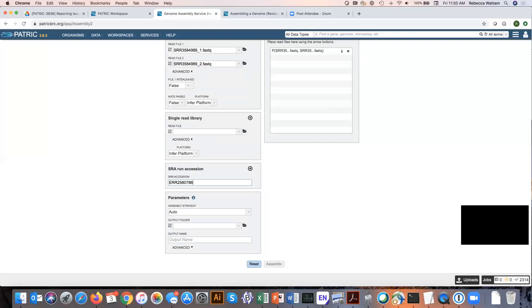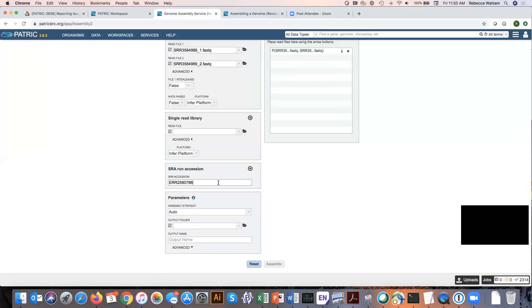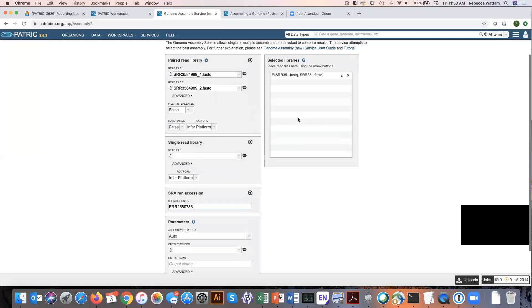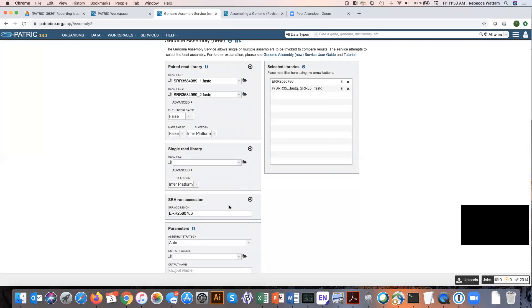So I have a run accession number. When I click this arrow to add it to my selected libraries box, you notice that there was a brief message that said it was validating it to prove that it was a good accession number.